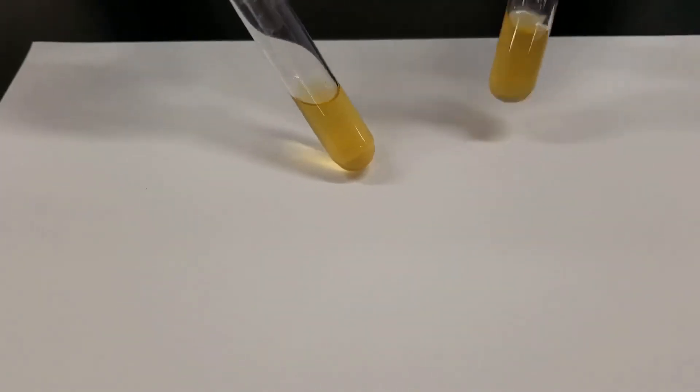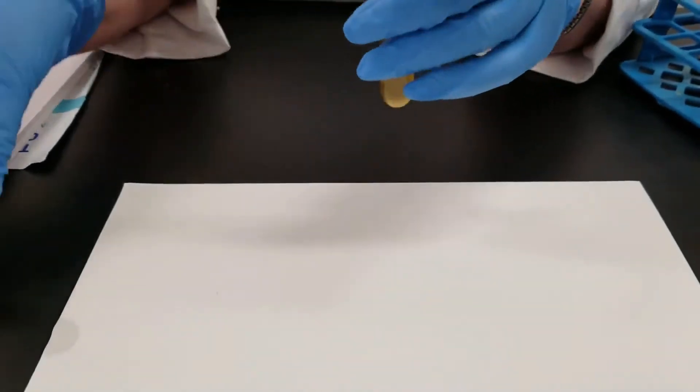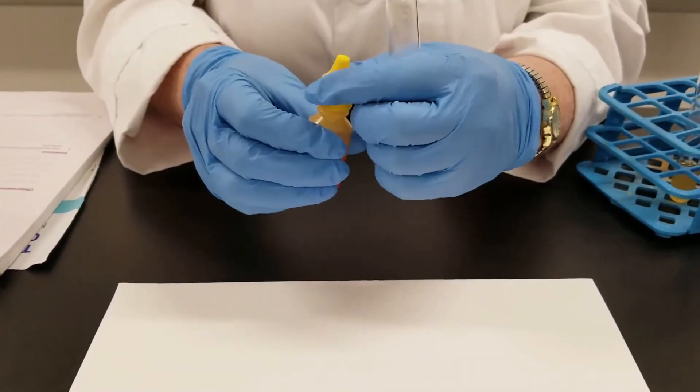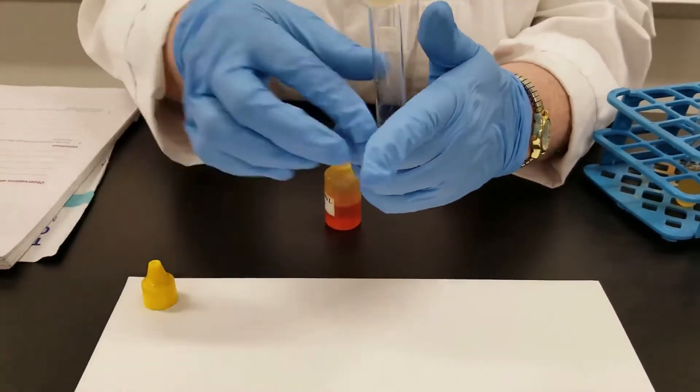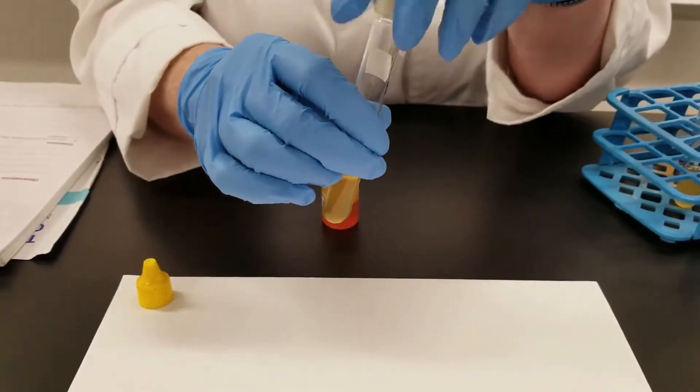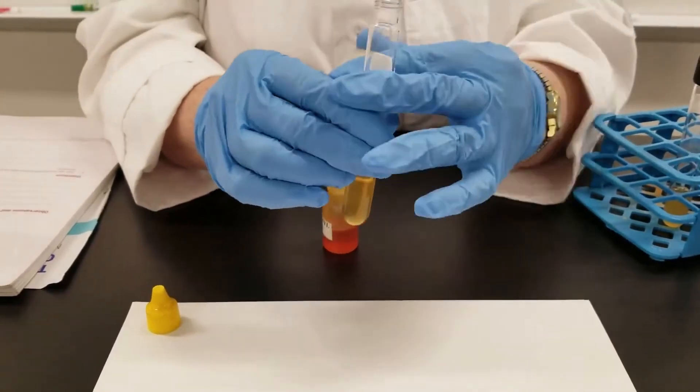So we have two different tubes here. To each one I need to add five drops of the methyl red. The first tube I have is the Proteus vulgaris organism. We had nice growth after 24 hours, so these were inoculated yesterday.